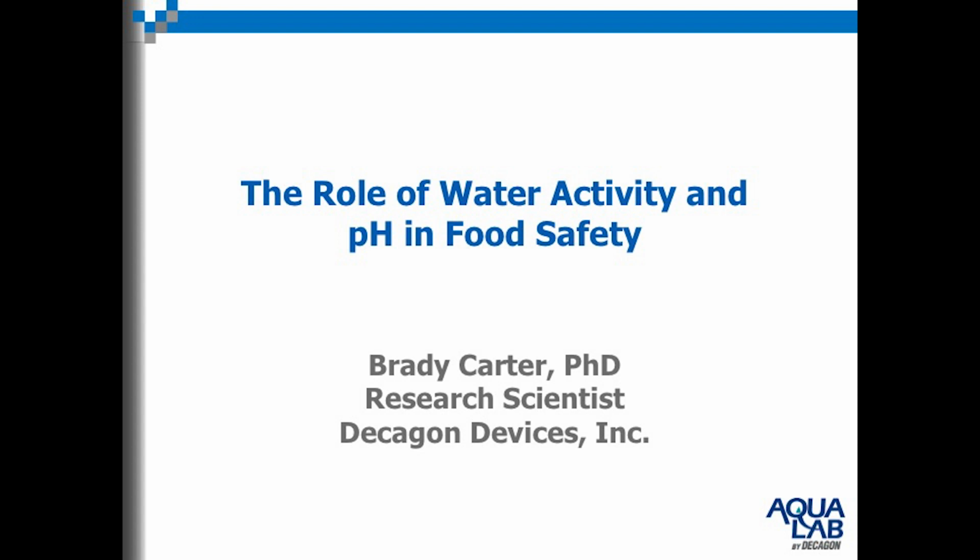I'm a research scientist for Decagon Devices, working in the areas of moisture relations and moisture interactions in foods. My area of expertise is in measurement of water activity and moisture absorption isotherms.